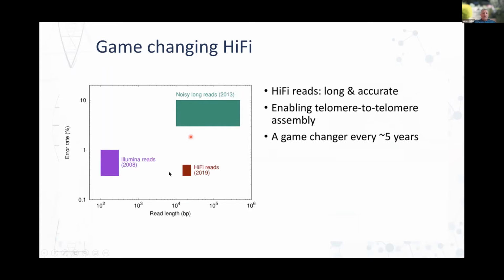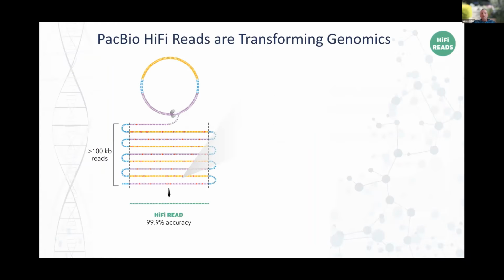But now, 5 years later, we have these PacBio HiFi reads, and they are being referred to as a game-changing technology. It was probably 2020 that it really took off, and now at the end of 2021, we're seeing the results of that.